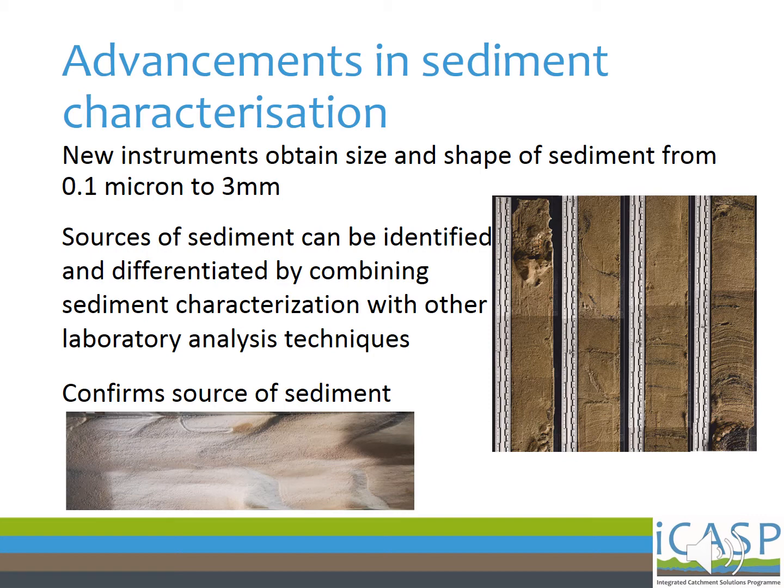Previously, a lot of grain sizing was done using laser diffraction, which assumes all of the particles are spherical and then outputs size as a percentage of sample volume. These instruments can also only measure a small amount of sample per run, so the data isn't as robust as newer methods. One example of the limitations is that if sediment is very angular and elongated, laser diffraction techniques can make it seem as if there are two different sizes of sediment present, as it measures the long and short size of the particles as separate sediment groups.